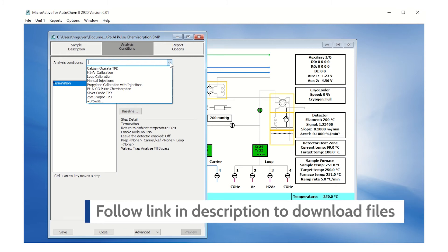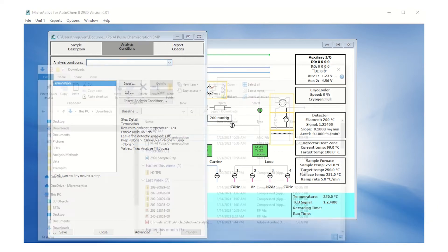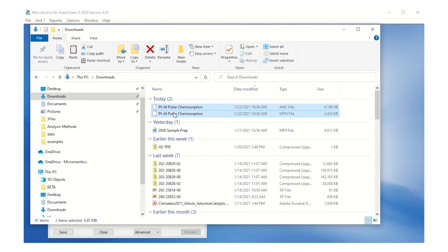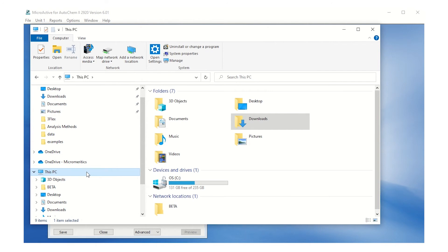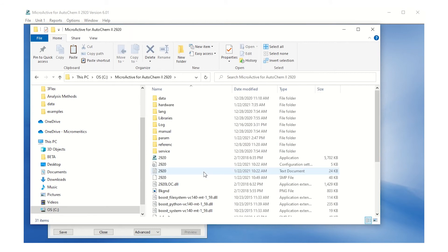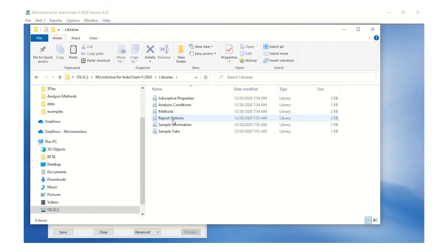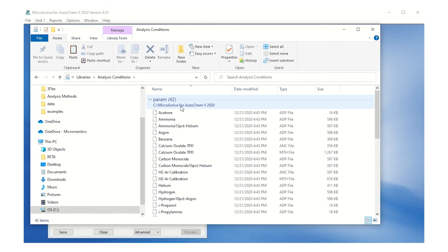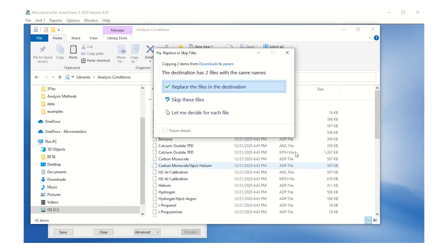Please follow the link to download the updated .ANC and MTH files. After downloading both files, copy the files and navigate to the Analysis Conditions folder. This is typically located in This PC, Drive C, Microactive for AutoChem 2 2920, Libraries, Analysis Conditions. Paste the downloaded files to this folder and replace over the existing files.